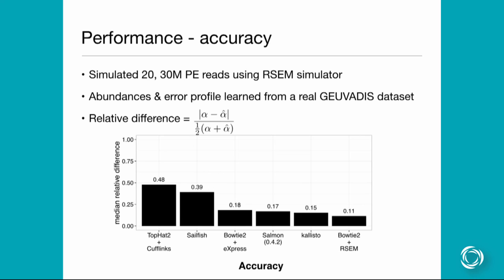Kind of. Even if I don't want to predict the novel isoforms, if you are trying to do the quantification, I think some of the reads that are mapping to the annotated isoforms are going to be mismapped. Sure, I would agree with you. And again, this is a systematic problem with any type of analysis like this. We're not any more susceptible to it than pretty much anyone else.